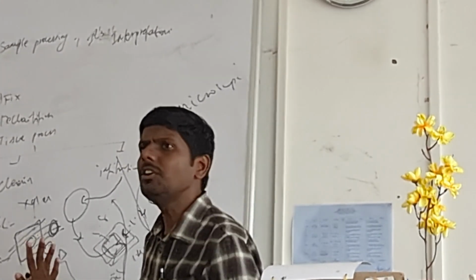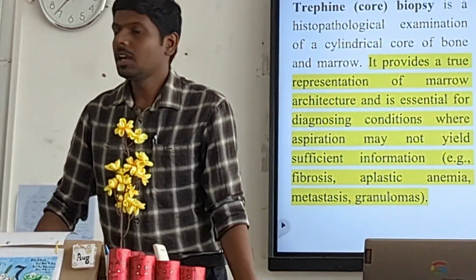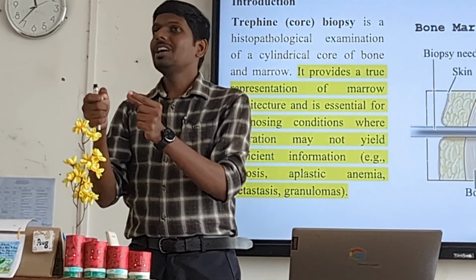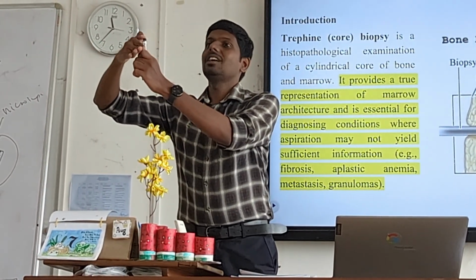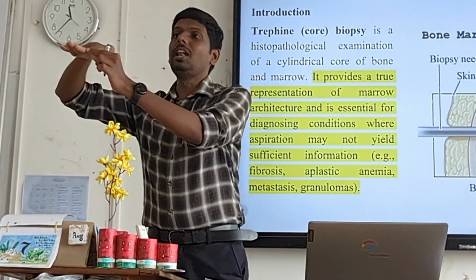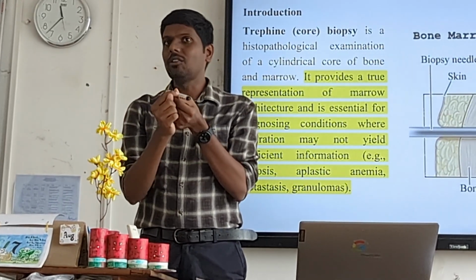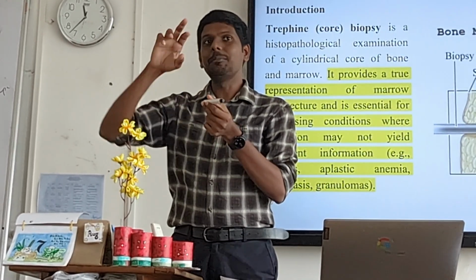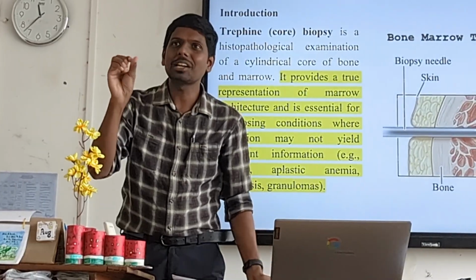Okay. Until here looking normal. For a normal tissue. Now listen. Our microtome knife is, of course, very sharp, but also it has a problem. If we encounter a hard object, the sharpness of this knife will be broken. It will be less. Now the knife will have nicks and ticks. Nicks and ticks means knife will become rough. If the knife becomes rough, the problem is we will get a lace chips rather than smooth chips. Okay, I mean that up and down slice. Okay, rough slice. We don't want a rough slice.